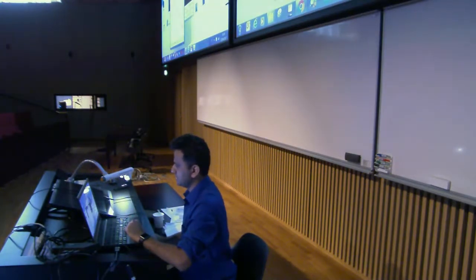So just click OK, and now this is showing the x-axis as time and the y-axis as the mean intensity of the entire image. But if you are interested in only a particular region of interest, then you can click here and go to Live. Now it has changed. And when you go here, it is going to show this vertical slide.